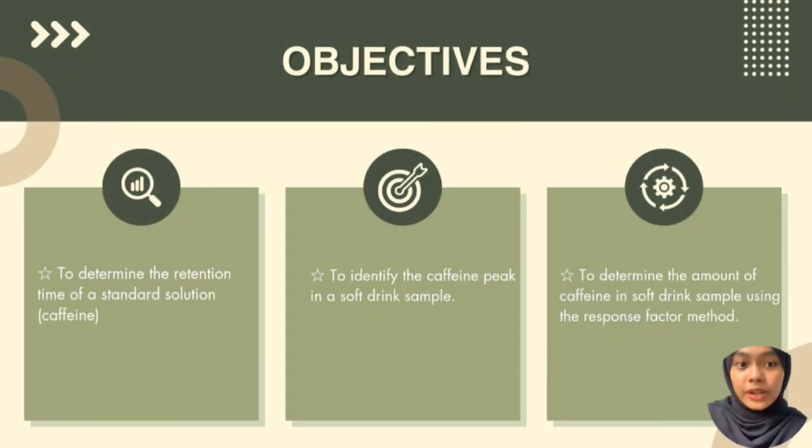Our objectives are to determine the retention time of standard solution caffeine, to identify the caffeine peak in a soft drink sample, and lastly to determine the amount of caffeine in the soft drink sample using the response factor method.